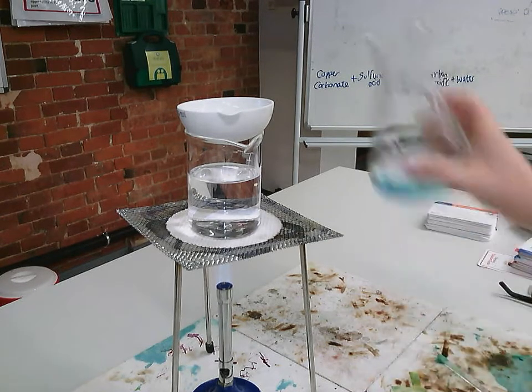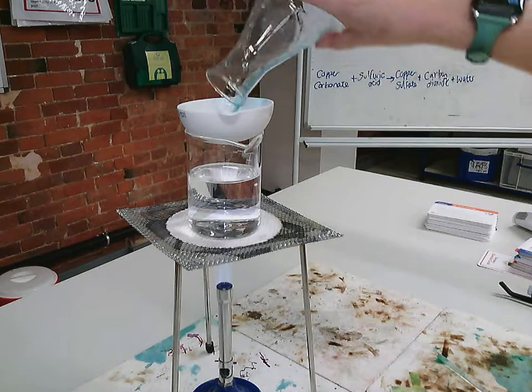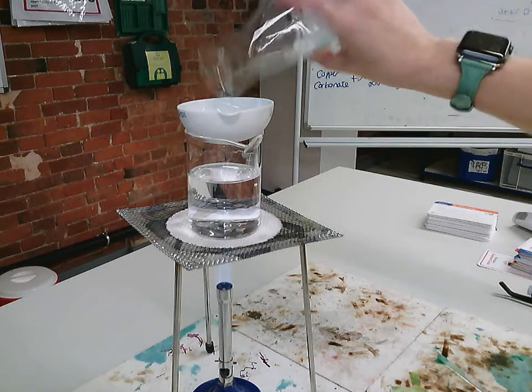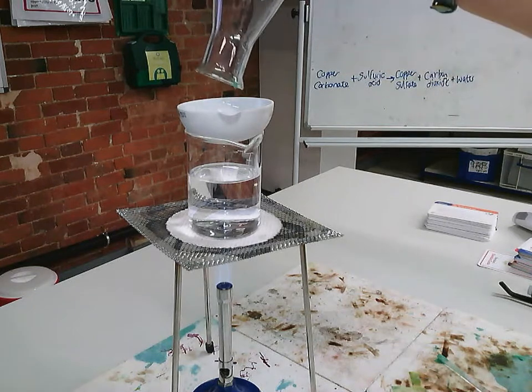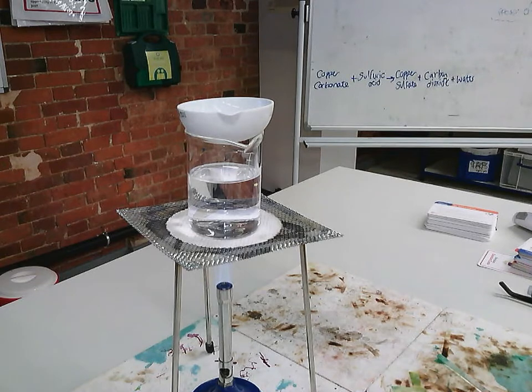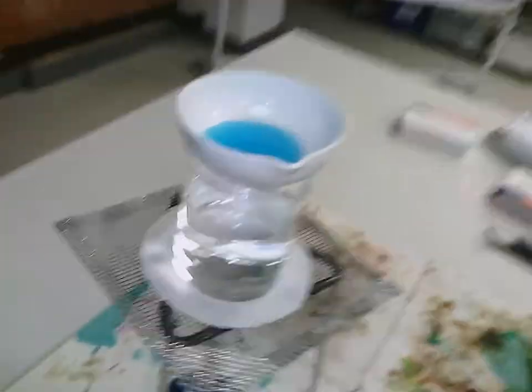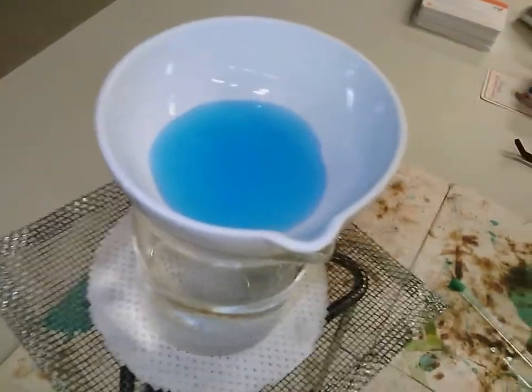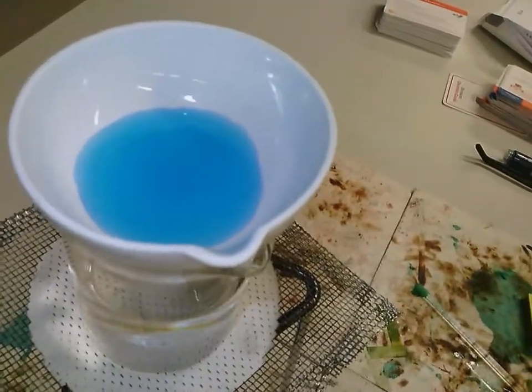So I'm going to pour that into my evaporating basin. Put in as much as I can, because one of the main aims of this experiment is usually who can get the biggest or most crystals. So, we've got in there the blue liquid. We're going to wait for it to start bubbling now.